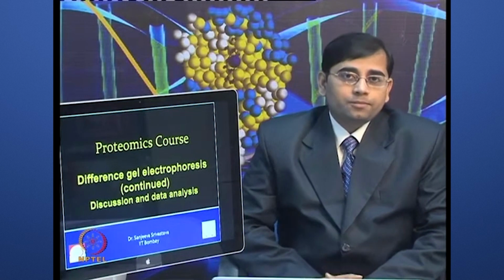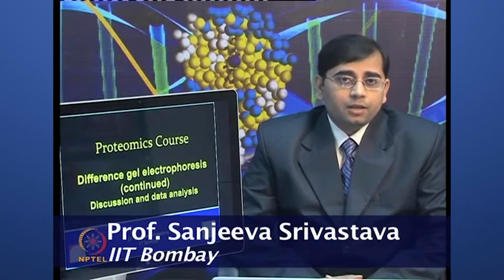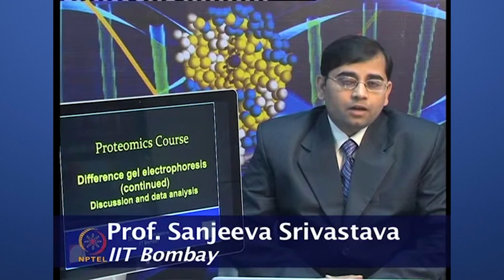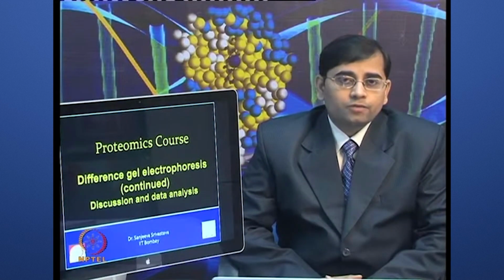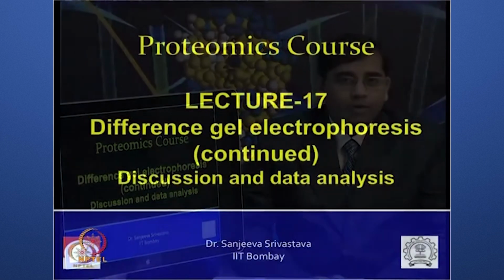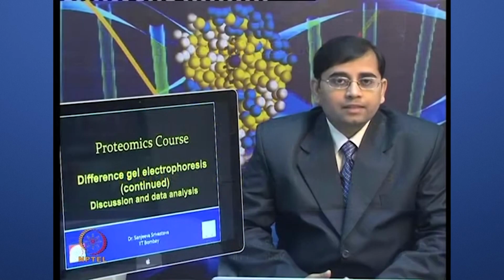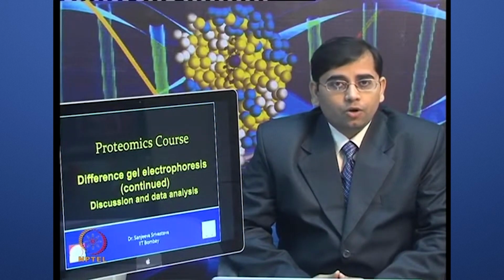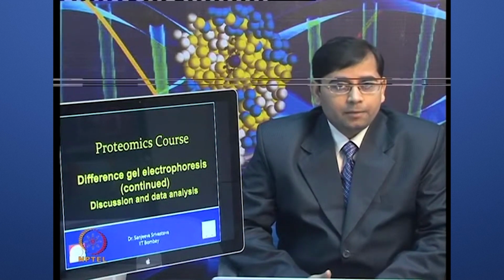Welcome to the Proteomics course. In the last few lectures, we have discussed gel-based proteomic techniques. You have seen how two-dimensional electrophoresis can be performed. There are certain limitations of this technology, so new, more advanced methods have emerged to overcome those challenges. In the last class, we talked about difference gel electrophoresis or DIGE, and you have seen how to perform the DIGE experiment in detail.